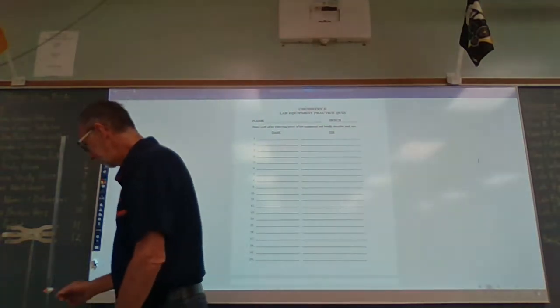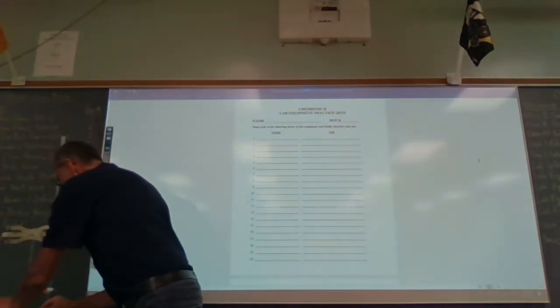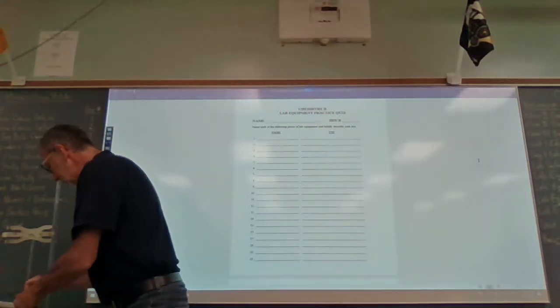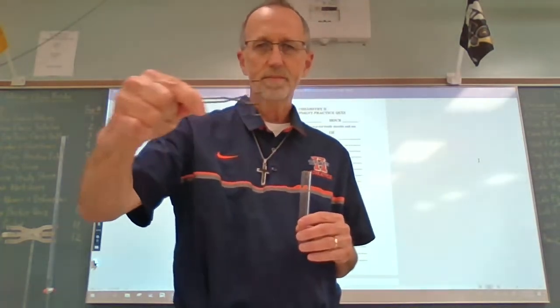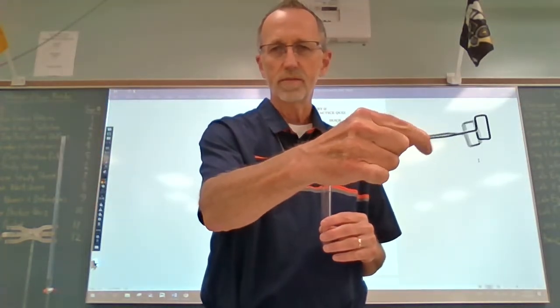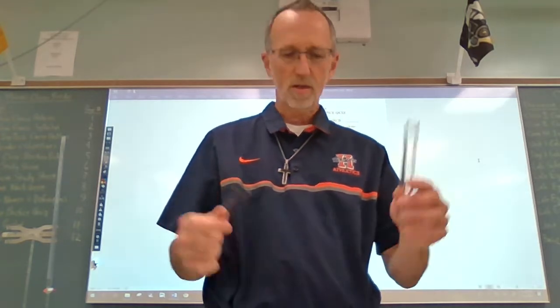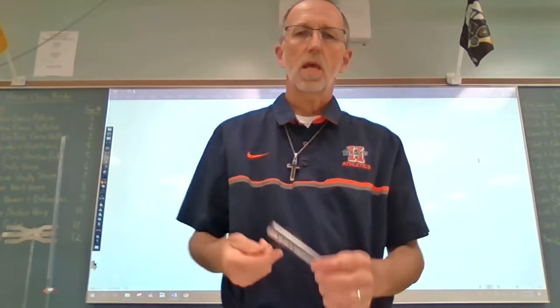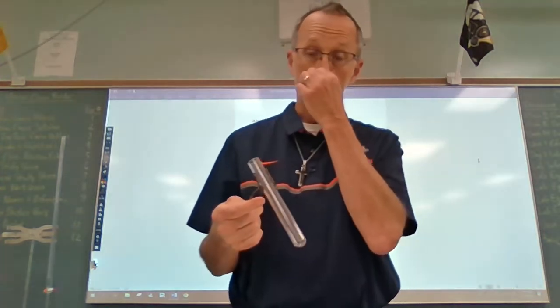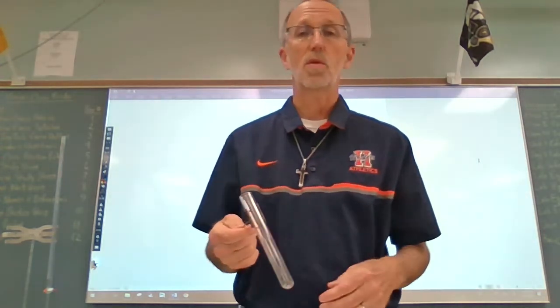Number 11. Well, I'm going to do 11 and 12 kind of together. This is number 11, a test tube holder, and number 12, of course, is a test tube. So the thing with test tubes, and the need for a test tube holder, is this.